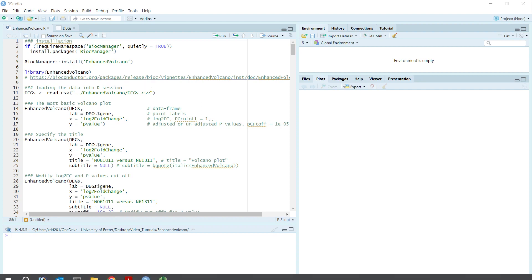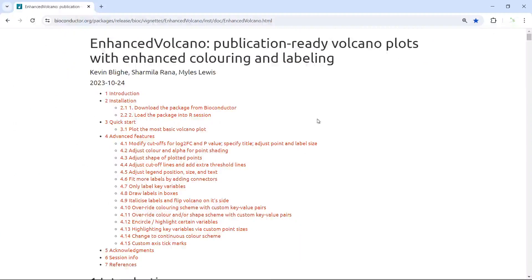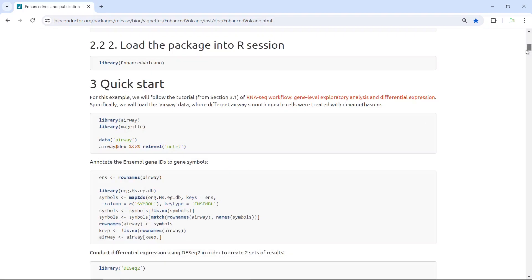We can have a look. You can see this is the online tutorial. I'm going to demonstrate some of the plots. You can read the online tutorial to see all the plot functions.